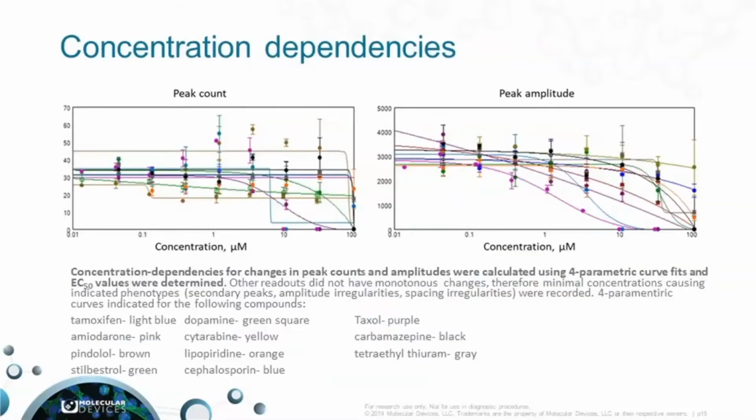Some of the parameters when treated with drug are amenable to concentration dependencies, and you can graph them. Some of them are not, as you can see here as well.